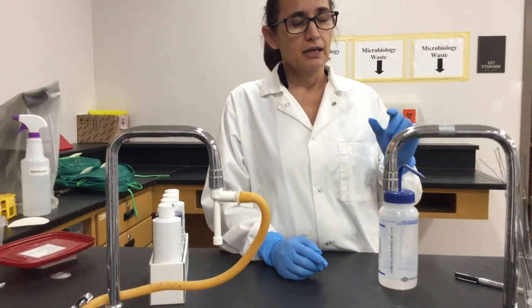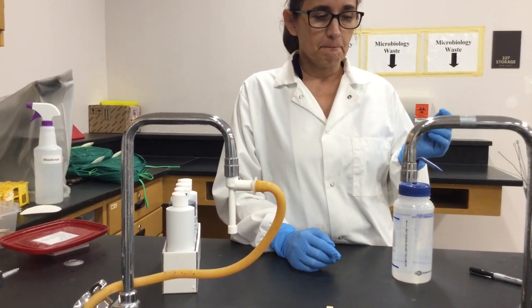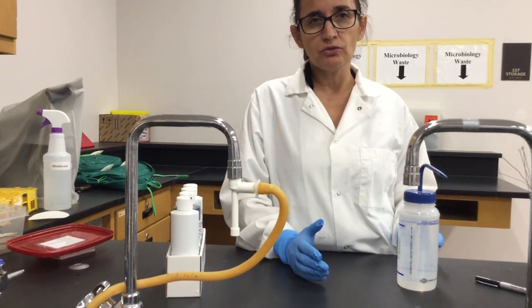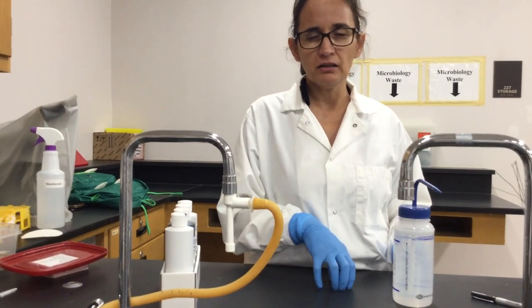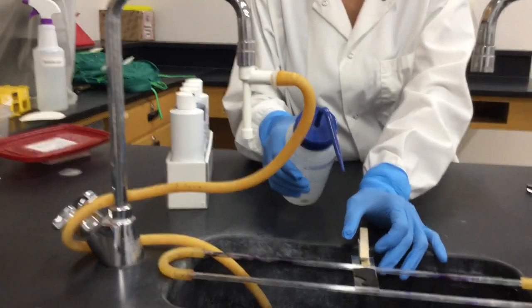And then we can have spirals that, depending on whether it's thick and short, you call a spirillum. If it's long and slender, you call it a spirochete. And they tend to arrange in groups, at least cocci and rods. A spirillum hardly, and spirals in general, spirochetes, they tend to form single groups.